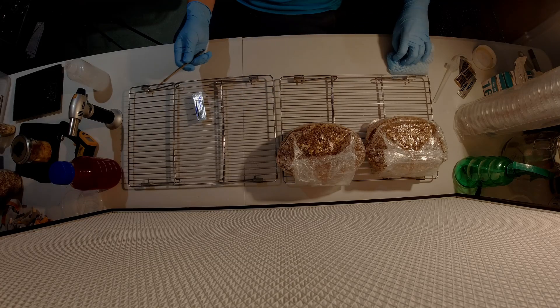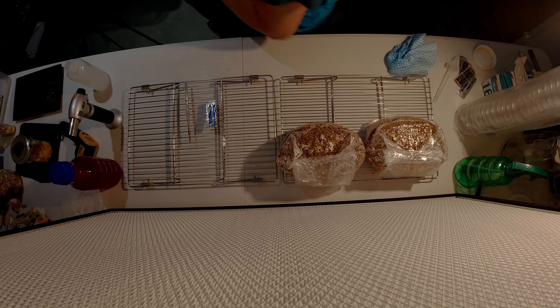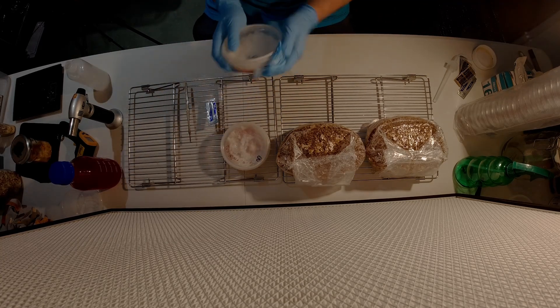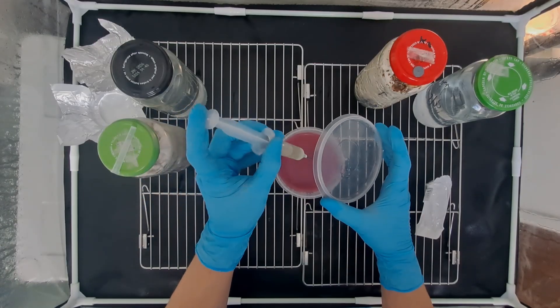In this video I'm going to show you how to inoculate grain bags with agar. To get to this point you should first inoculate some agar with a liquid culture syringe or perform an agar transfer from a pre-existing plate.